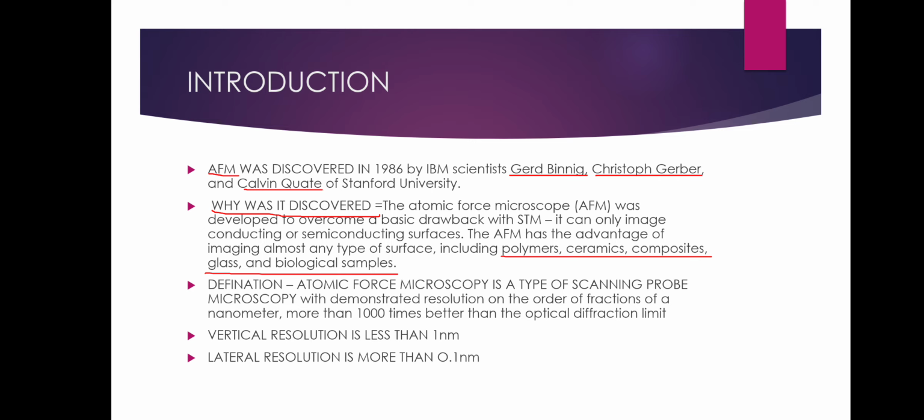So the main reason for the discovery of this AFM was to overcome a basic drawback with the scanning tunneling microscope, which can only form images of conducting or semiconducting surfaces.